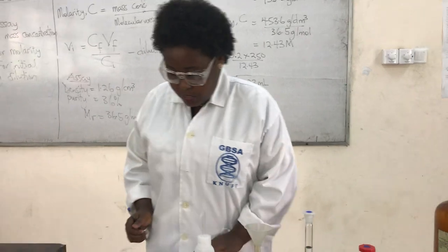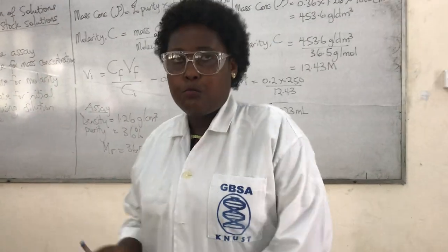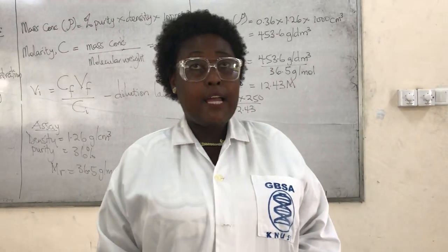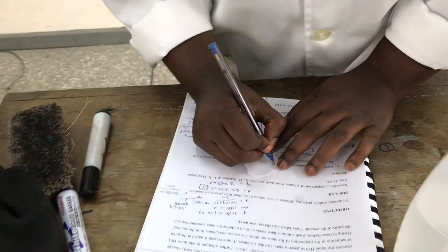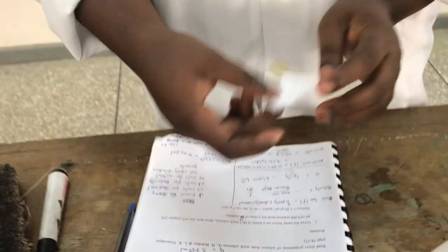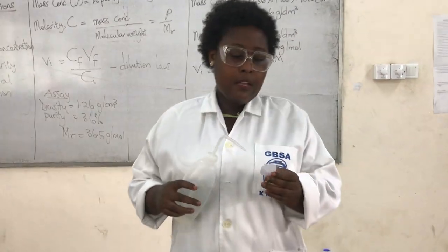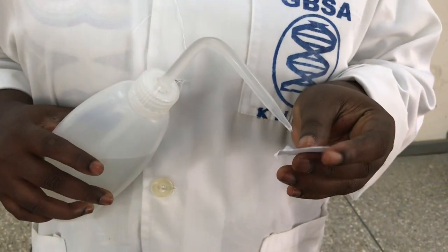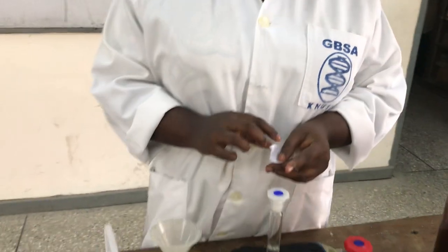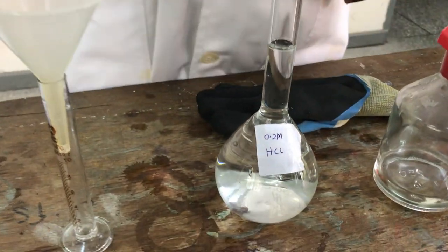We have prepared our solution — it's very simple! Now you must label it properly. Write the concentration on a small piece of paper: 0.2 molar HCl. Wet the paper with a small amount of water so it sticks on the volumetric flask. It is always important to label your solutions.